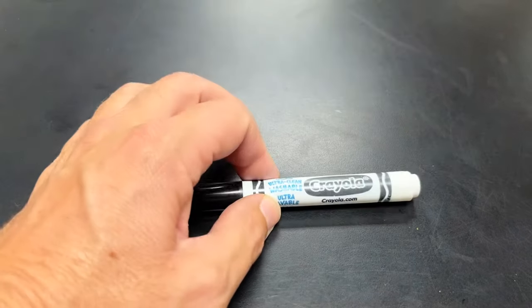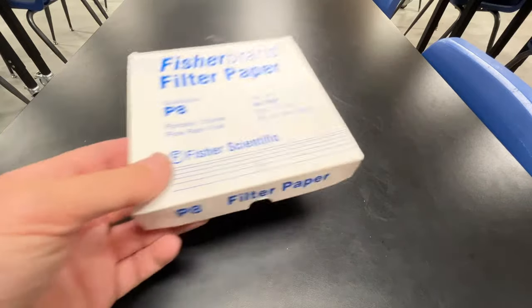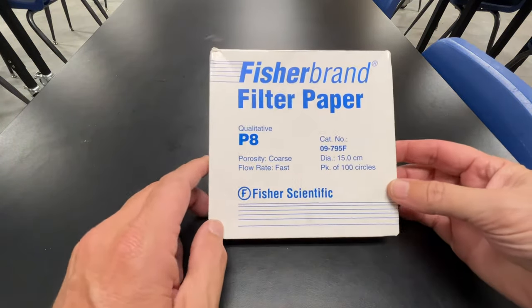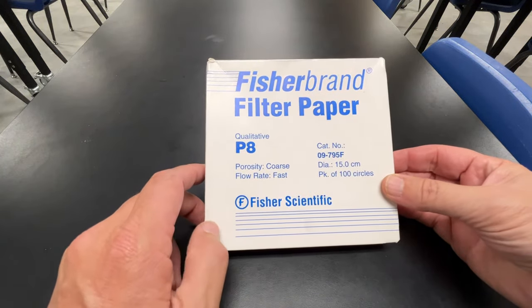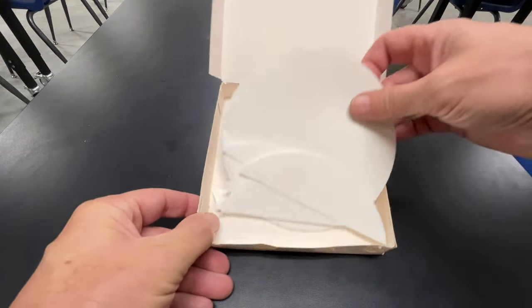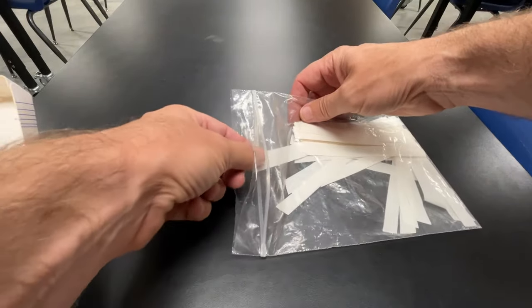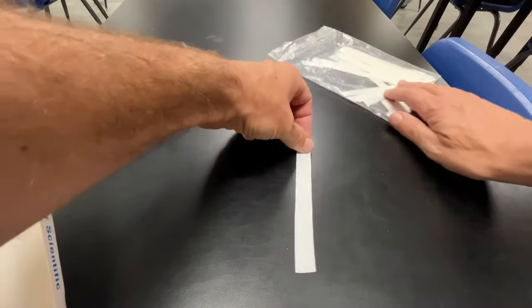In this experiment, I'm going to prove to you that black ink is a mixture of colors. To do this, we need a piece of filter paper. This is special scientific filter paper, and I cut these circles into strips so that you have this. I'm going to take one strip — that's all I need. If you don't have filter paper, you can also use paper towels.